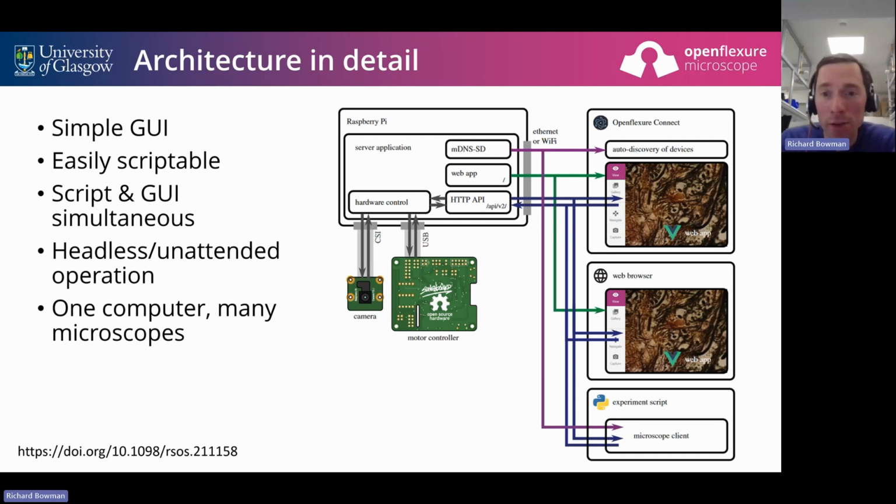I talked about headless or unattended operation. Essentially what I mean there is that I can start an action that might run for an hour. And if I disconnect my client from the microscope, the action keeps running. And again, this is fantastic because a common bugbear in experimental labs is that Windows decides to update and your computer spontaneously reboots halfway through an experiment that needed to run continuously for a week.